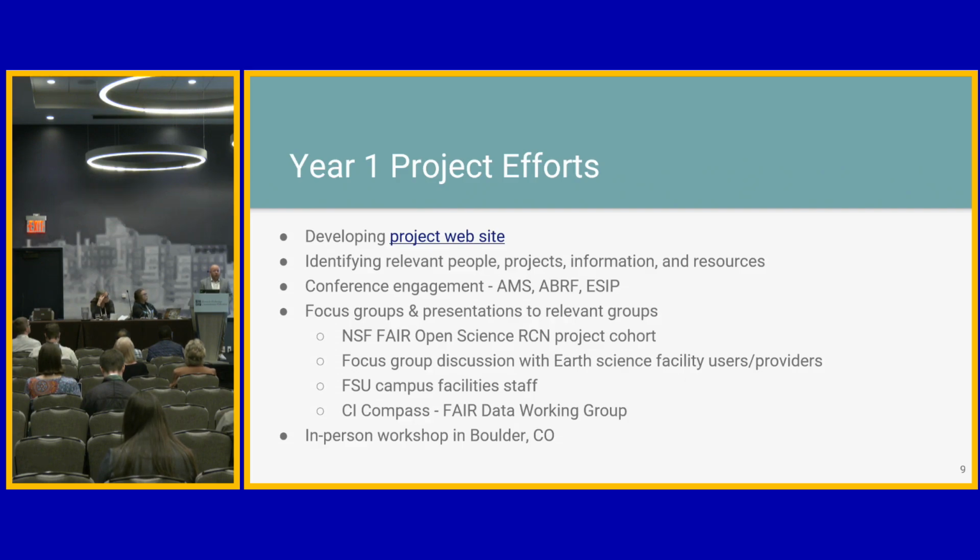I was here last year for the first time ever, and we did a poster on the idea of our project and some of the things we were going to try to do over the next year. Then we did focus groups and presentations. We had focus groups at FSU at the Highfield Magnetic Laboratory, and focus groups of folks that worked at core facilities at Boulder. We were trying to generate low-hanging fruit and figure out what some of the barriers to PID adoption for facilities and instruments were.